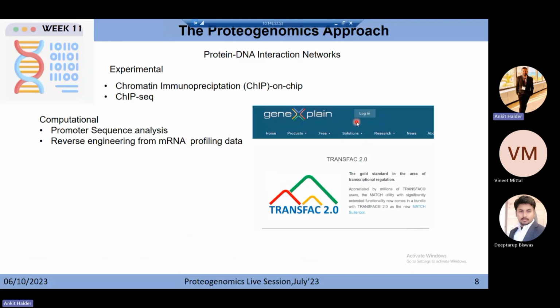We had also discussed chromatin immunoprecipitation, ChIP-chip and ChIP-seq, if you remember, or you can always revisit week two or those weeks where we discussed ChIP-seq, the chromatin immunoprecipitation, which showed us the protein-DNA interaction networks.